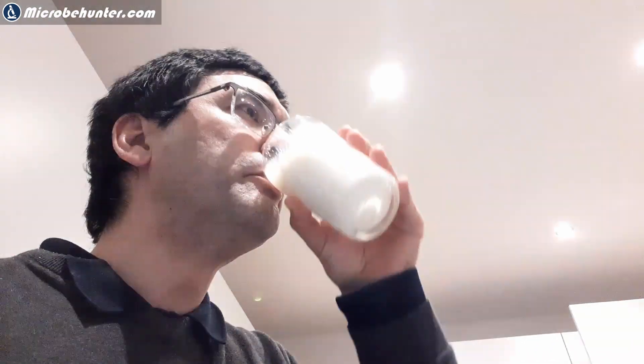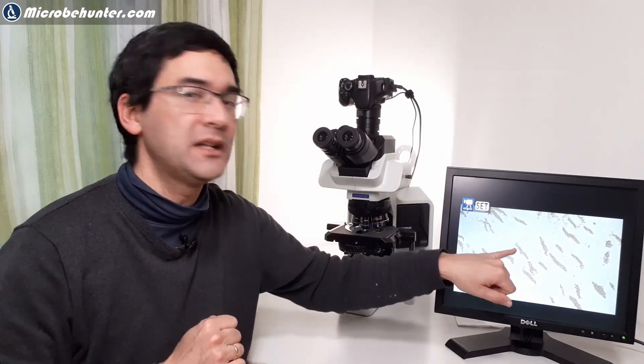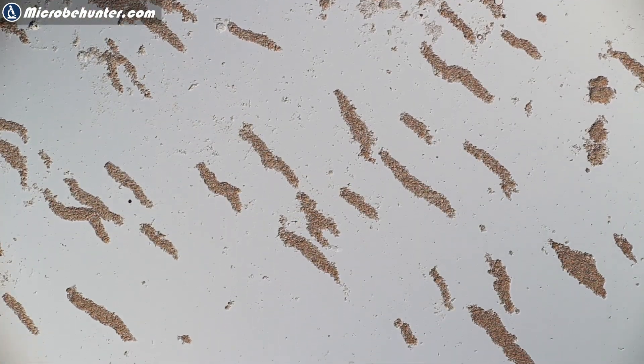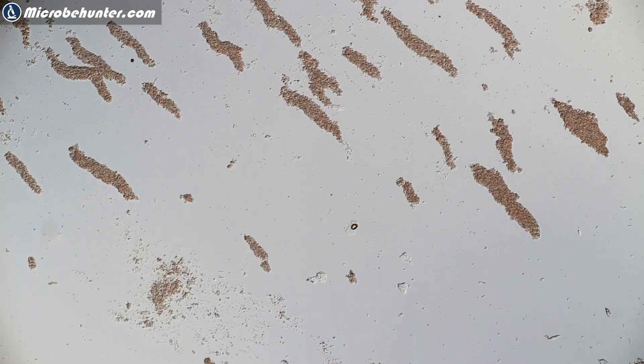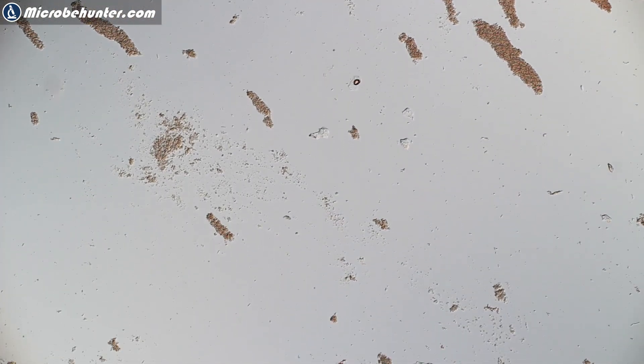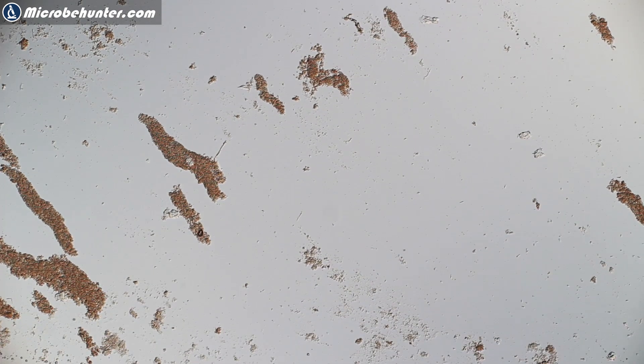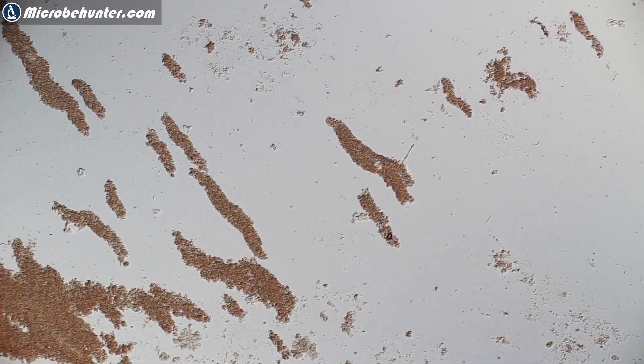As a matter of fact, I've already brought along a picture where I added a little bit of the kefir fungus under the microscope. You can see these long clusters here - these are aggregates of bacteria and fungi. The bacteria are a little bit difficult to see here. They're kind of small and transparent, so later on I will be using phase contrast to make them a little bit better visible.